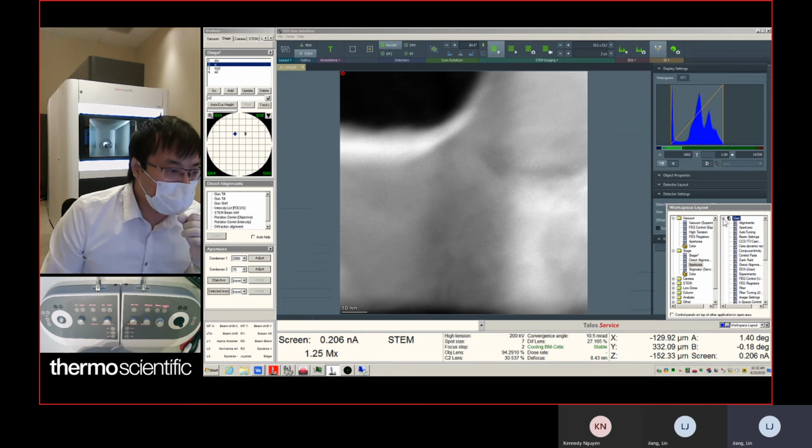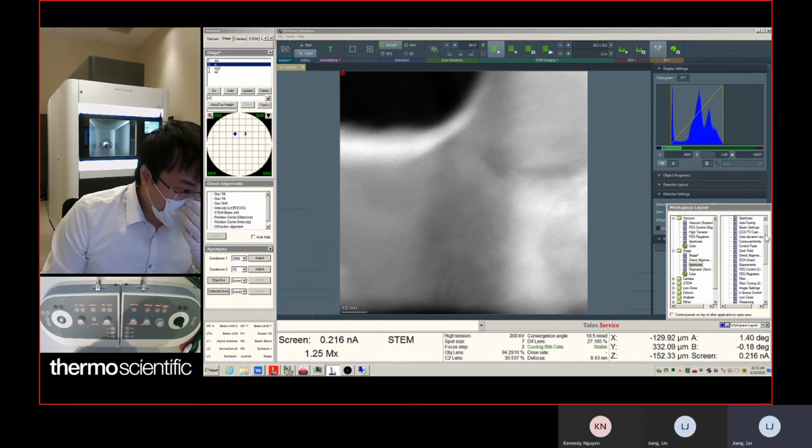Usually you just add some functions in the workspace under the user. So for example, here I want to add, let's add vacuum, for example. Just put it here.